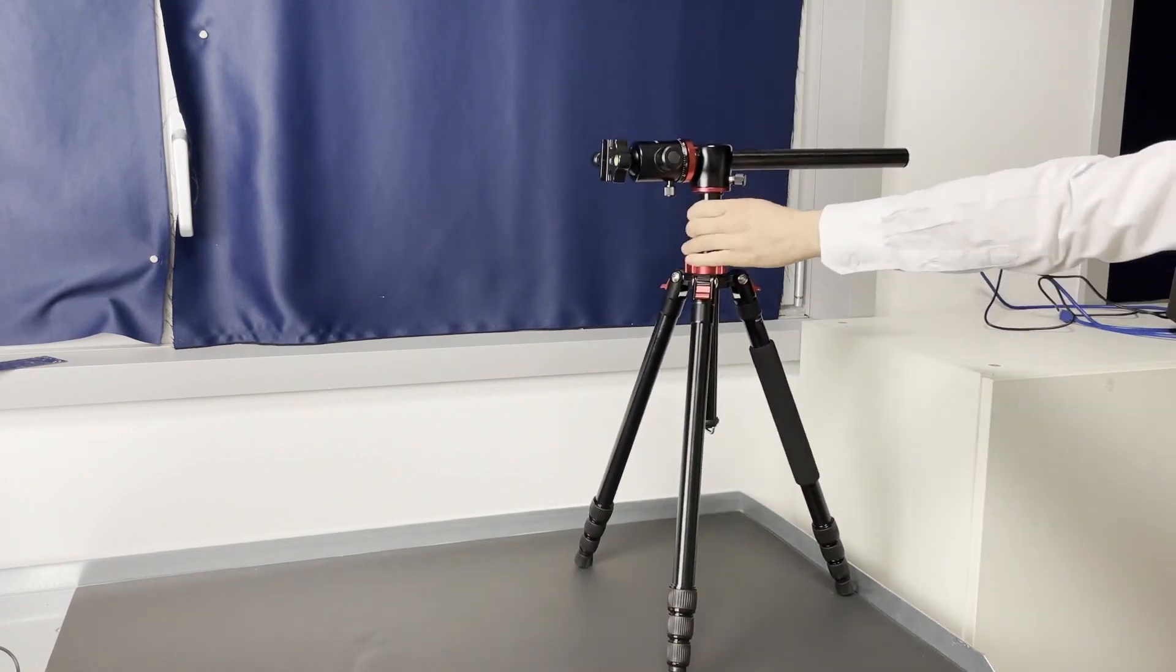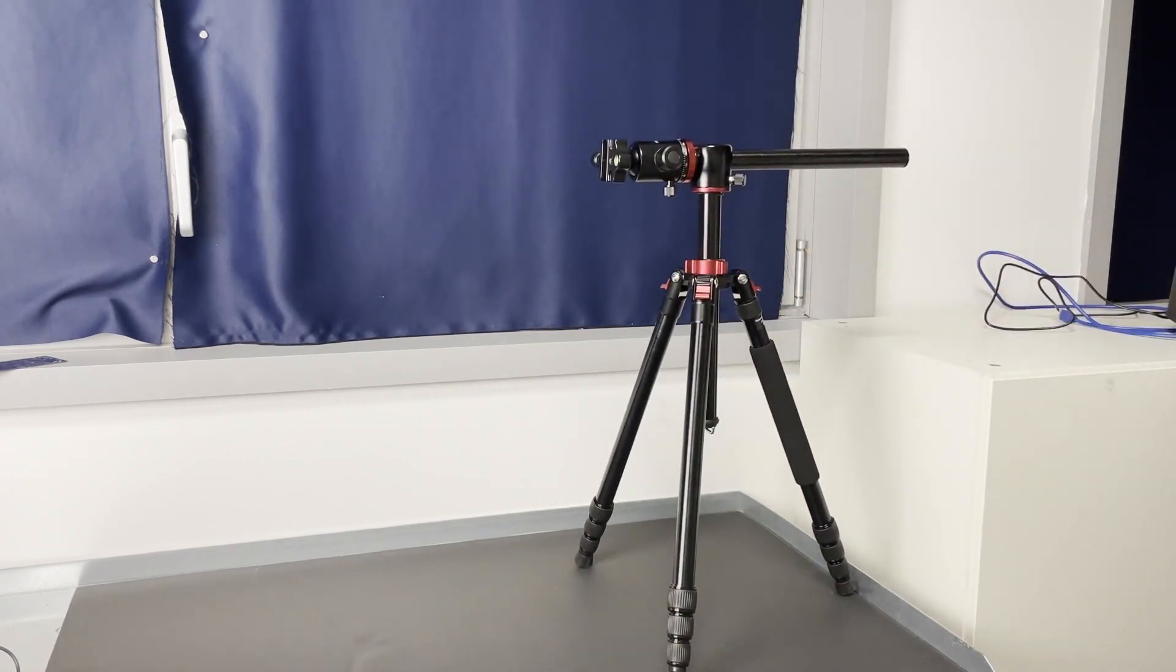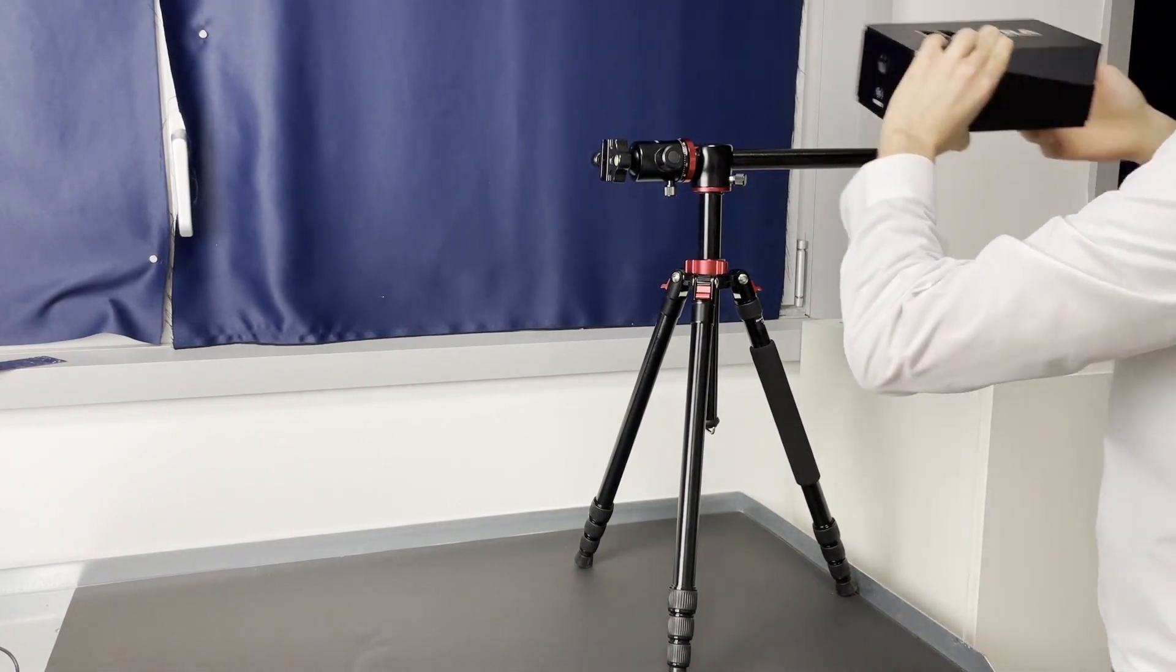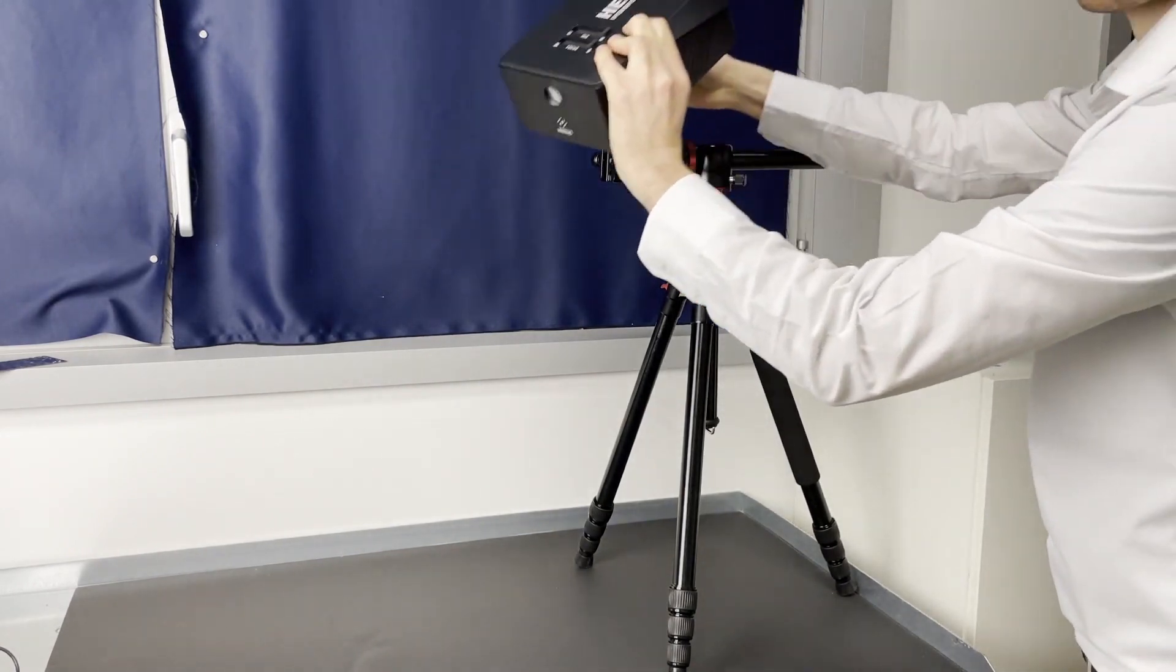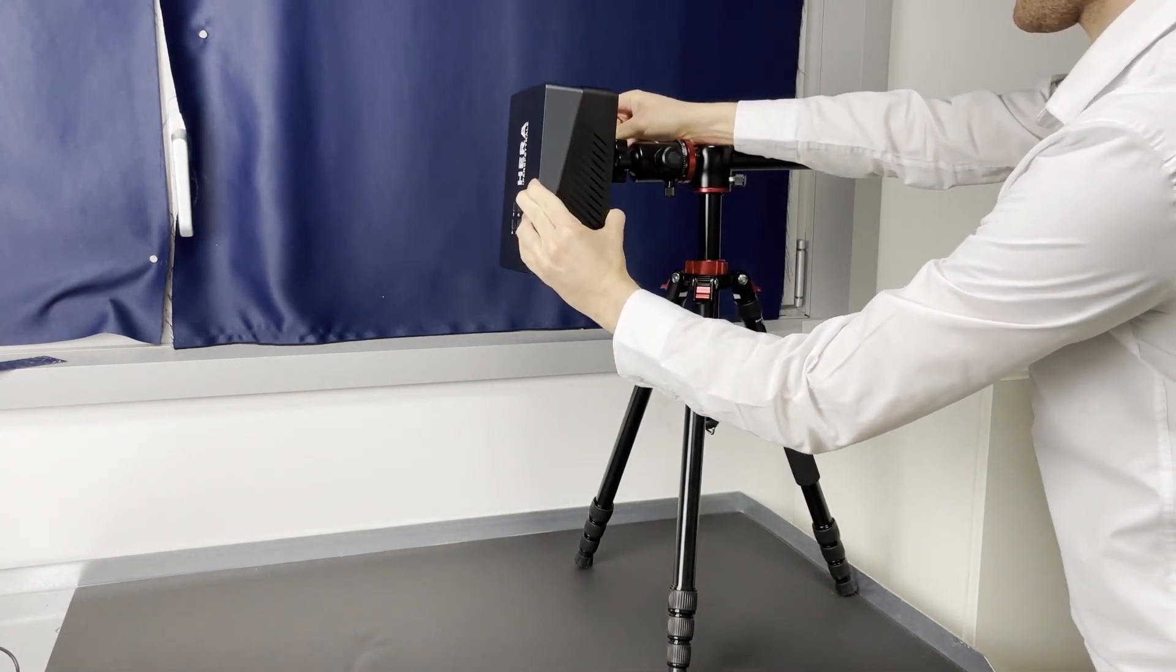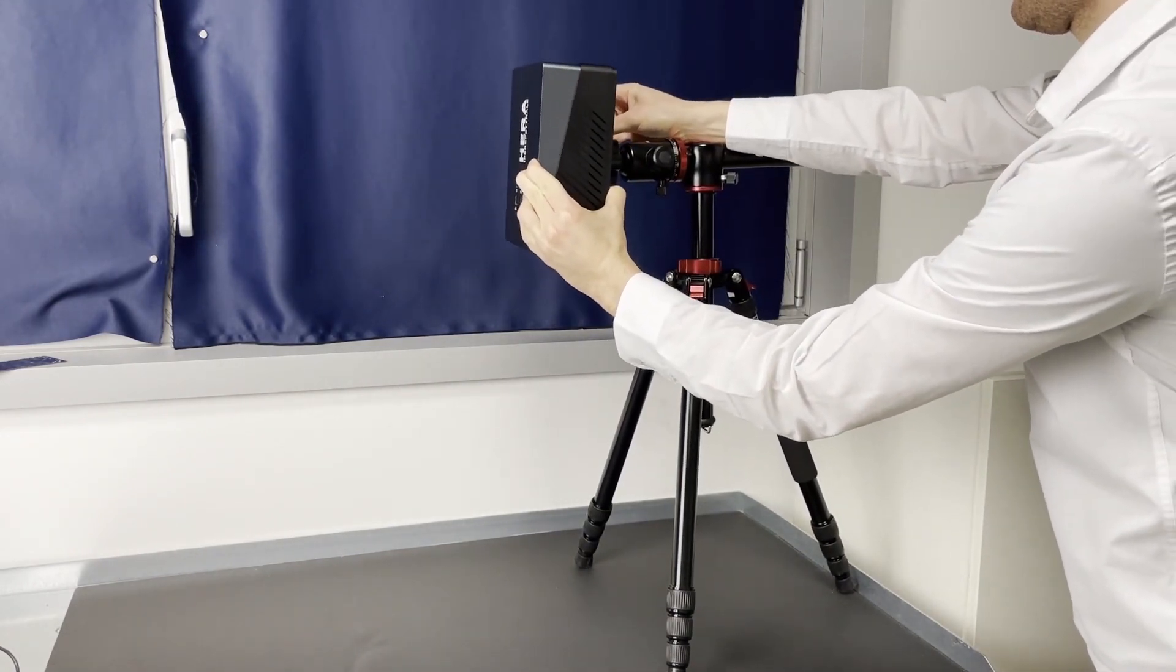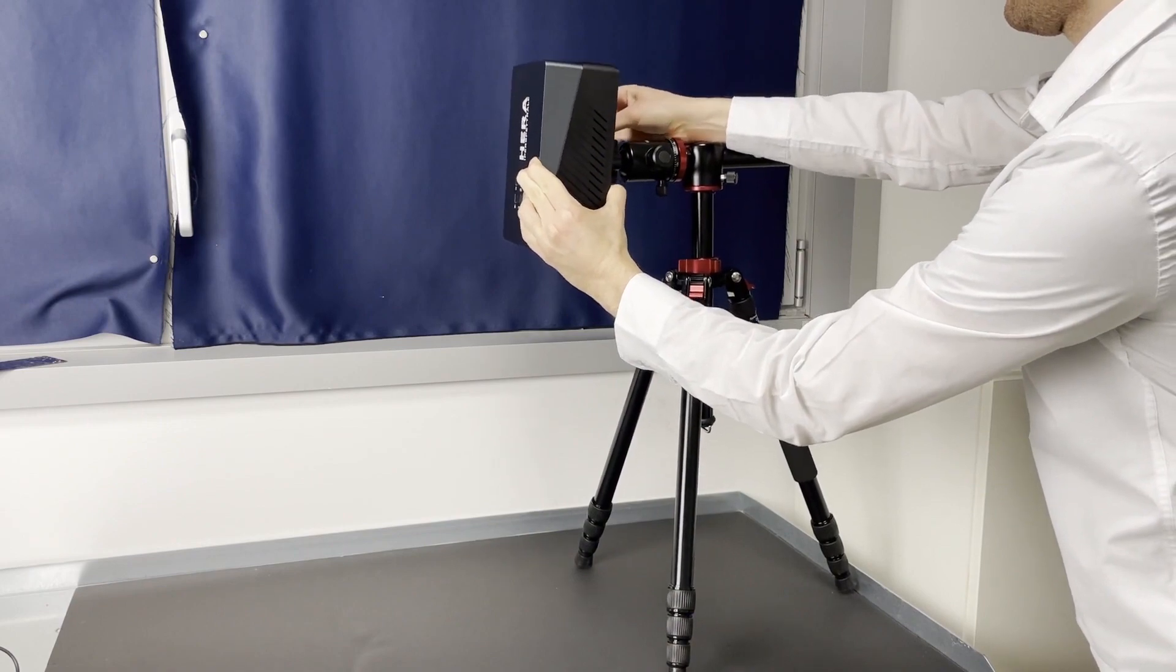Now let's get started. For a proper measurement, the camera is mounted on a tripod. It can be placed either in vertical or horizontal position, just depends on the geometry of the measurement.